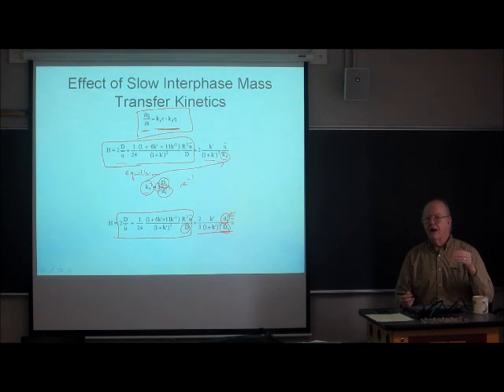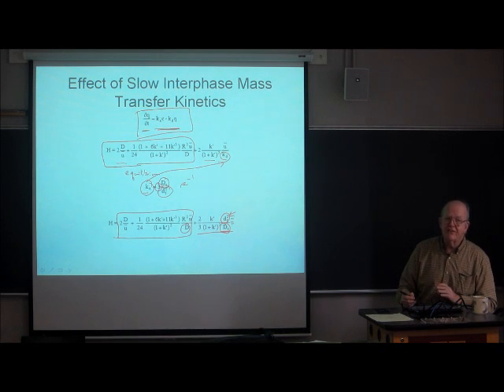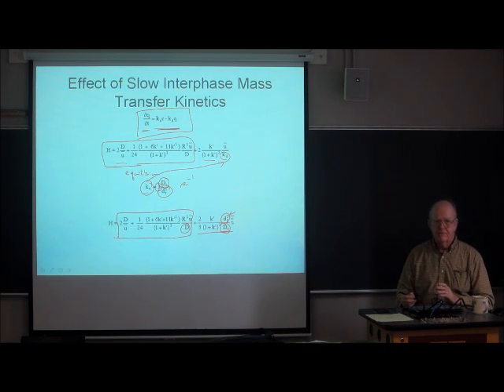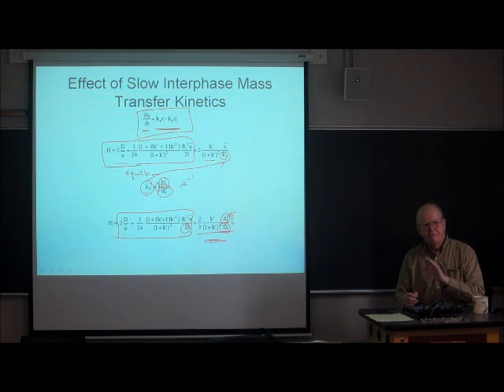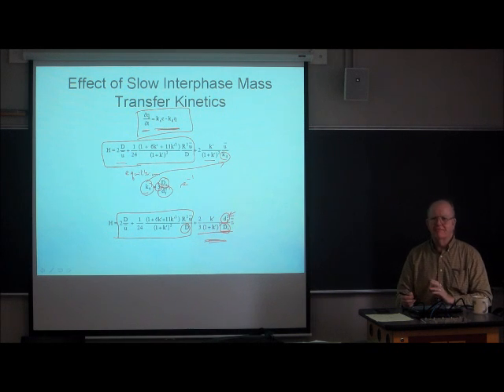And in what we call a high resolution capillary, that film would be only a few tenths of a micron thick to make this pretty, I can't say negligible or insignificant, but minor.